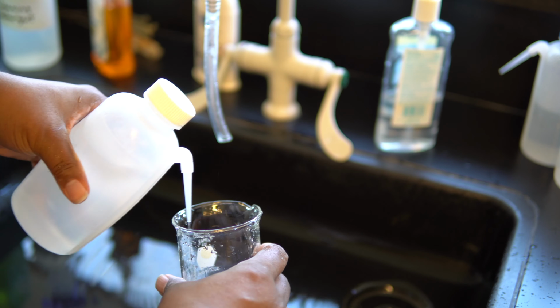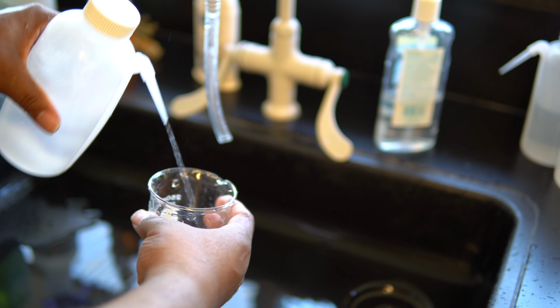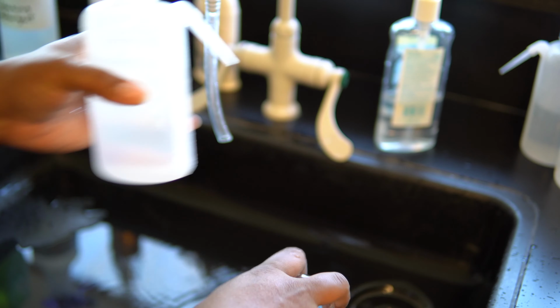Clean and dry the lab equipment and then return them to your equipment kit. Clean and sanitize your workspace. This concludes our investigation of equilibrium and Le Chatelier's principle.